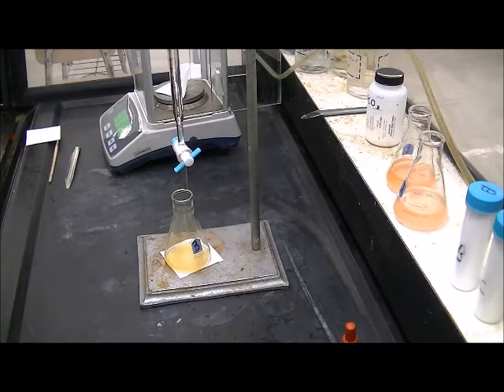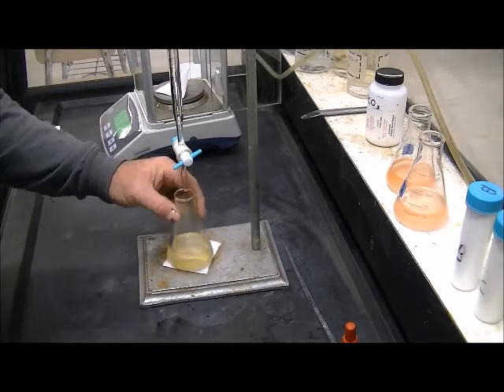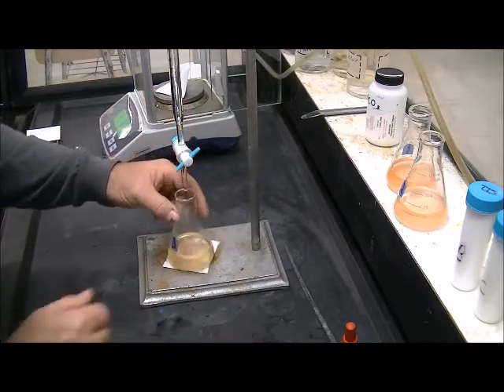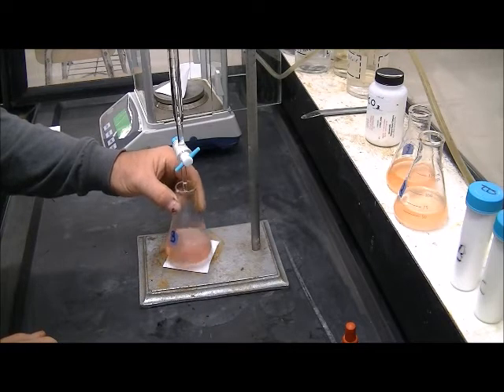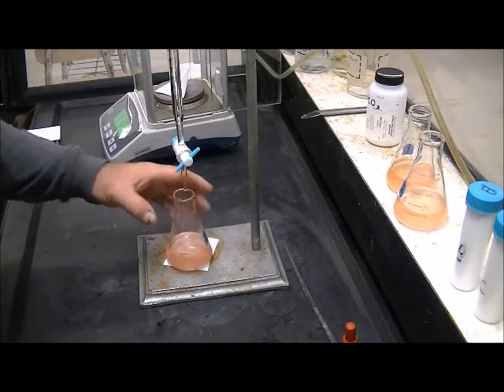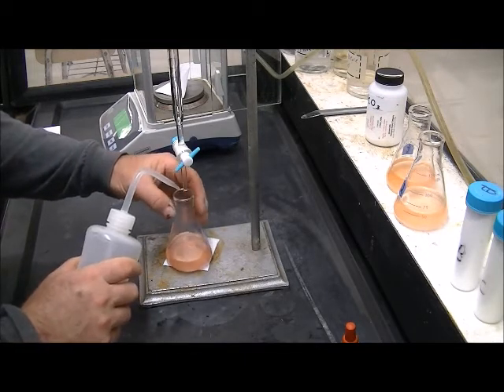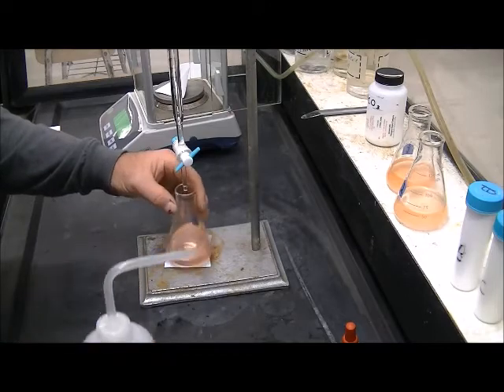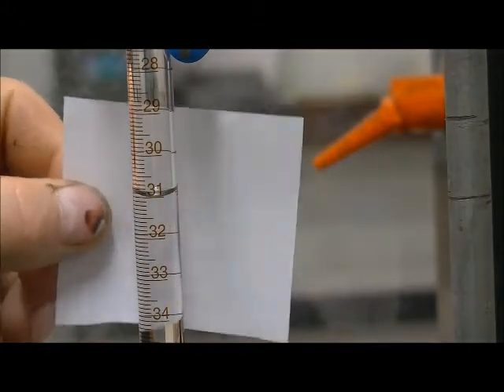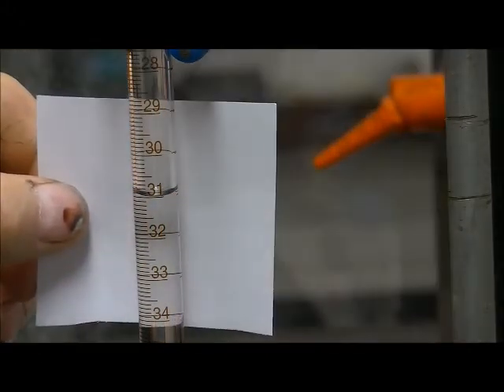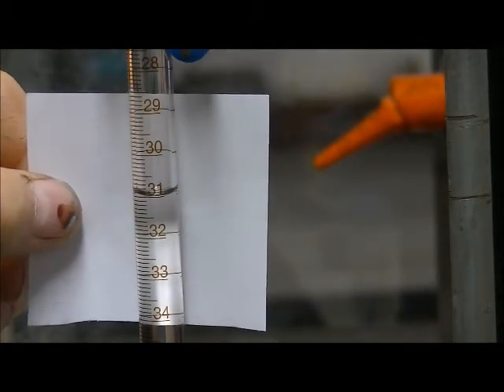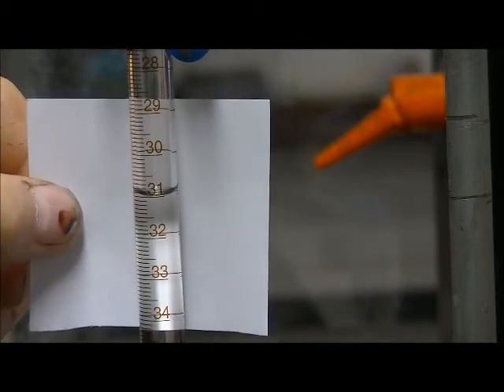This is sample three of unknown A. That looks like an end point there. Make sure everything is down in there in the reactor area. And the end point measurement is 31.0. Right on the 31 line. So I'm going to write down 31.0.